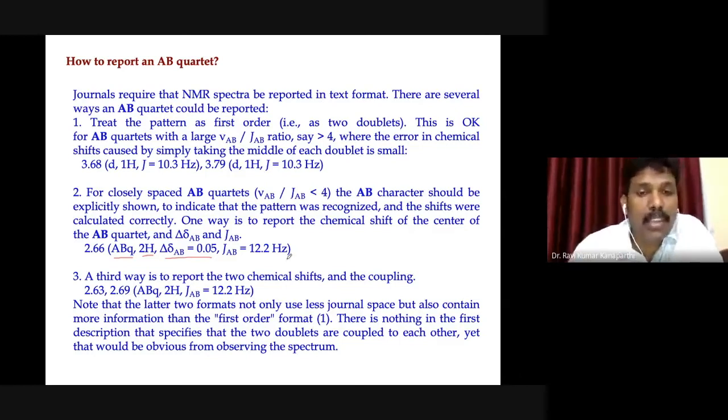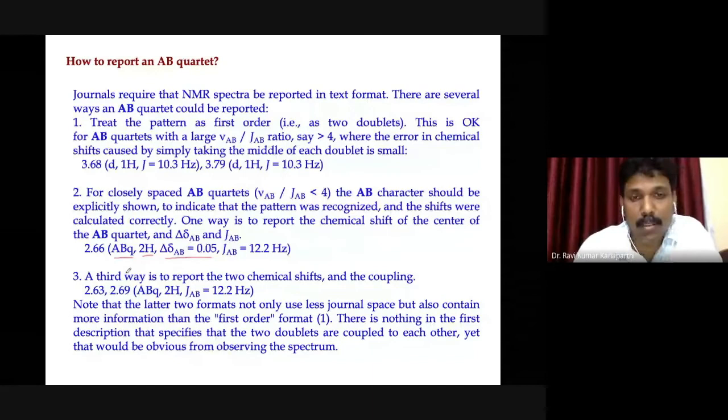Another way is that instead of representing only one, you can also represent the two doublets separately. That is also possible.